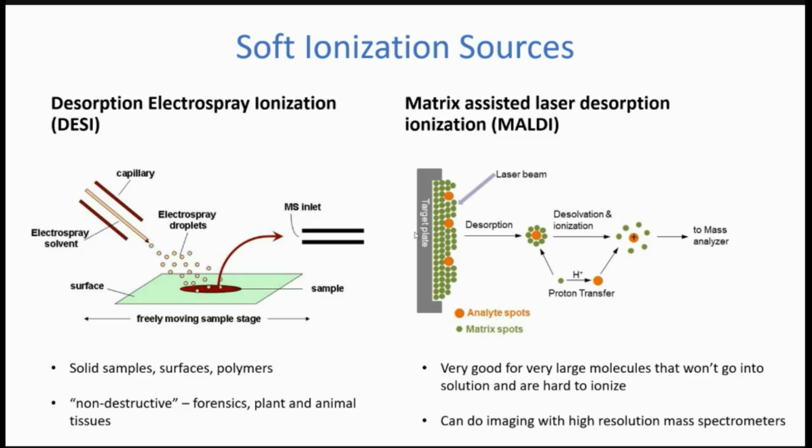For those of you who don't know, here at the university I'm working with a group of people on a really large CFI proposal this year, and we're trying to bring in some new mass spectrometers, not just to do proteomics like in my lab, but to do some really cool imaging with our forensic scientists. So if we have our high resolution IMS TOF, the timsTOF, which I'll tell you about later, paired with one of these MALDIs, you can actually image at a molecular level. It's very hard to describe, but it's very cool. We'll talk about it a little more later.